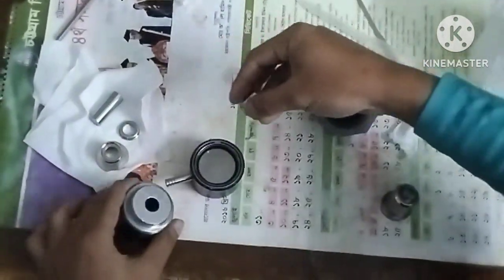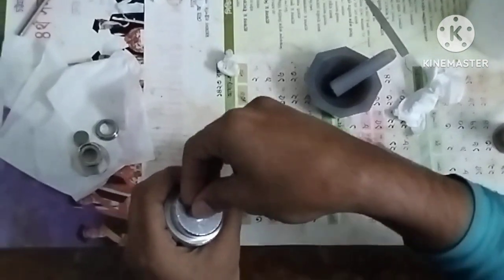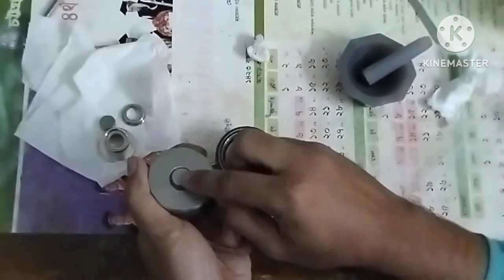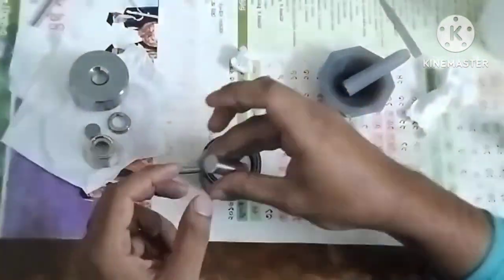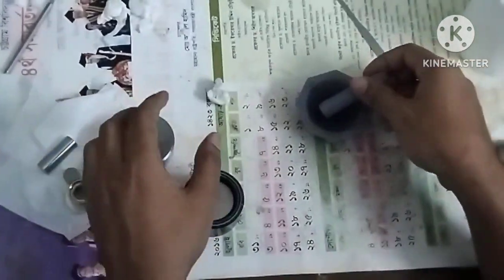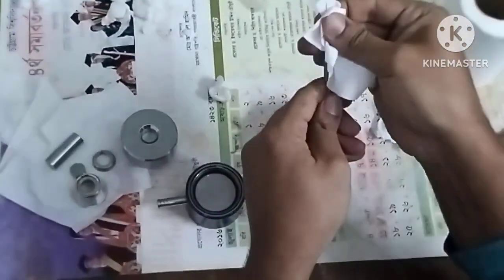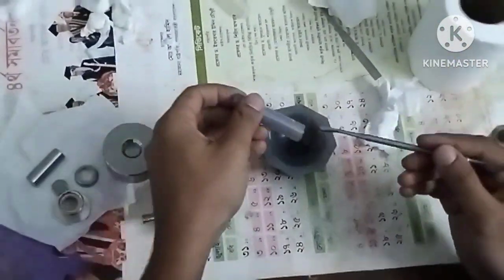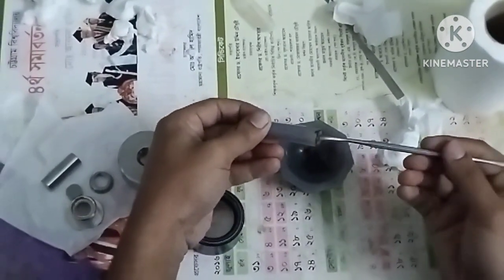Then we will mix it, and after mixing properly we will transfer the mixture from the mortar to the steel pot, where at first we transfer a small steel component into the larger steel setup, and then we transfer a small amount of the mixture of KBr and sample using a spatula.